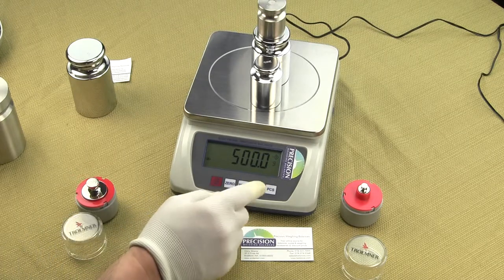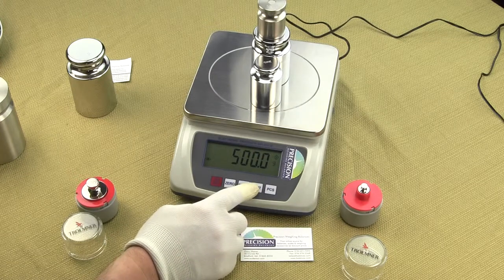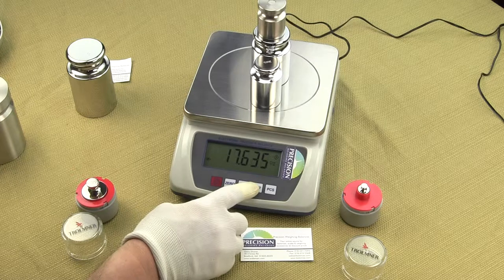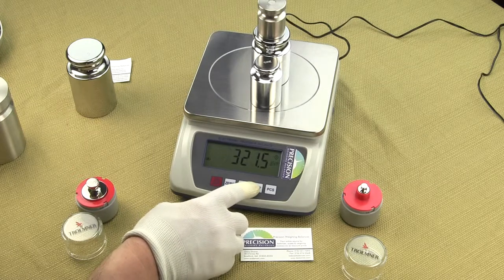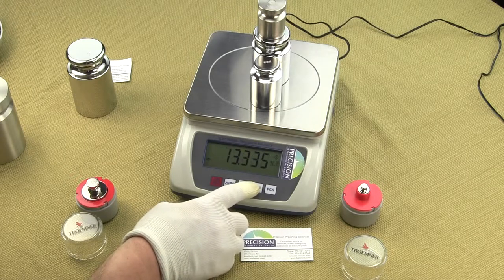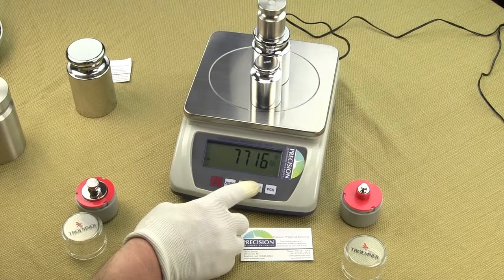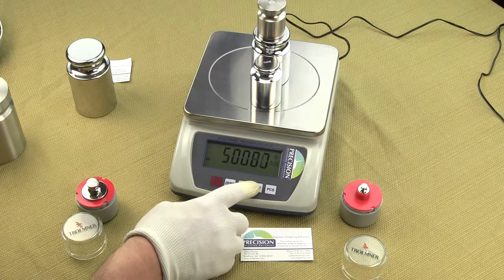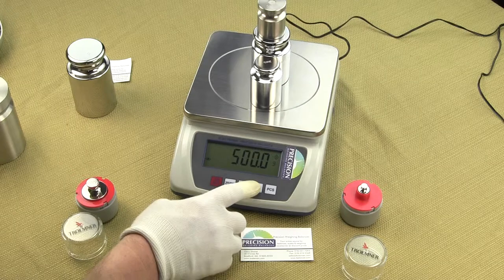You have the ability to change weight modes by simply pressing the units key. Presently we're in grams. We'll change to ounces, pounds, pennyweight, troy ounces, carats, and then there are several foreign weights: tael, grains, mommeh, and tola, which are all used overseas. And we're back to grams.